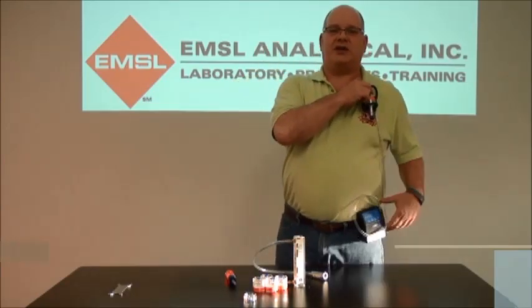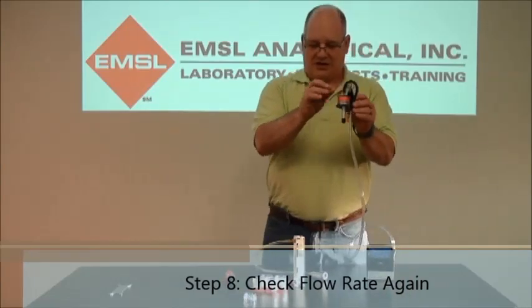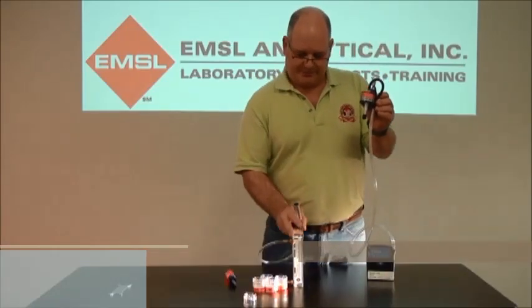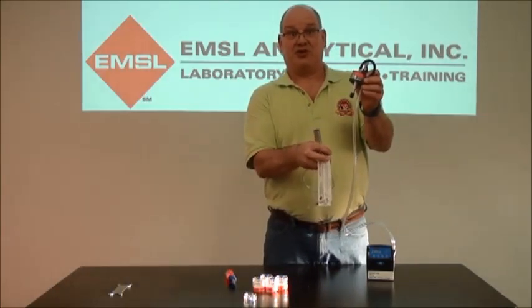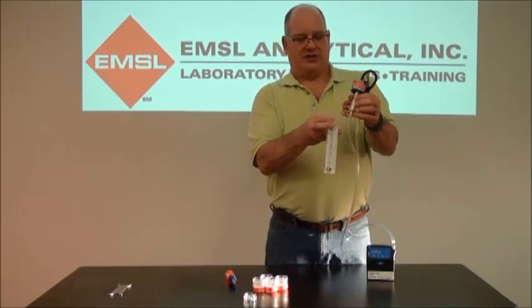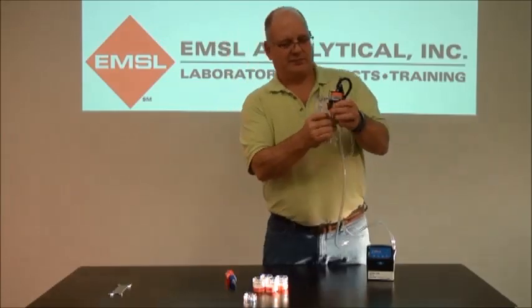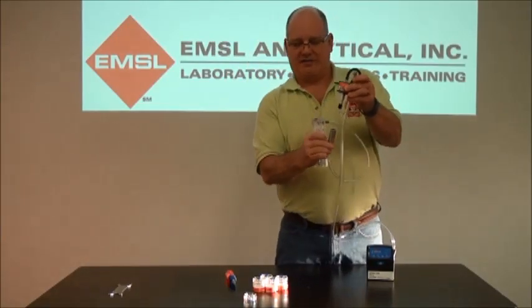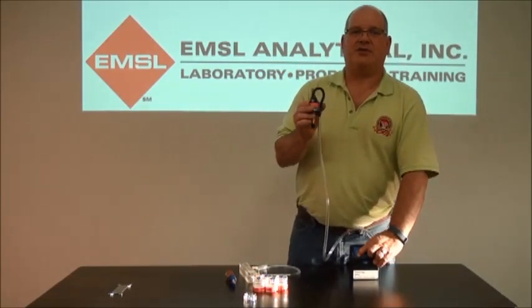At the end of the sampling period, take the pump and check the flow rate again. Make sure you write the flow rates down when you check them in your chain of custody. Attach the adapter and check the flow rate again, then take it off. Turn the pump off — the Libra is turned off by holding the power button down for five seconds.